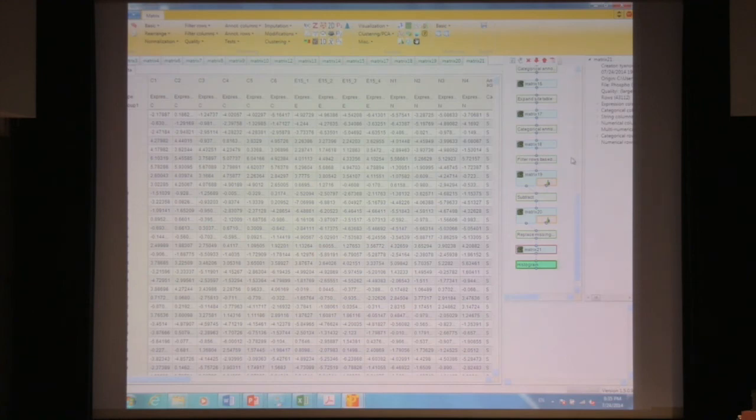Hopefully you remember from yesterday that we have these underlying matrices. Quality was one of them, and another one was is imputed. Now, because we've done imputation, we will have a matrix underneath called is imputed, and some of those will be populated.